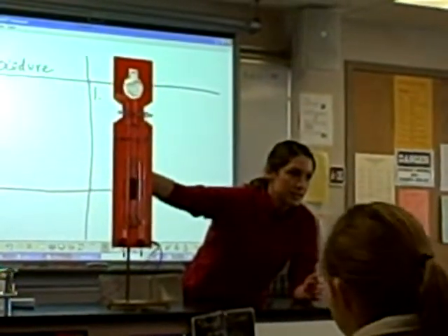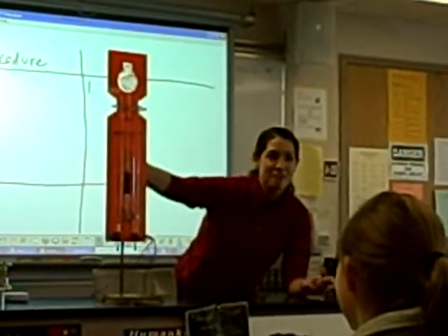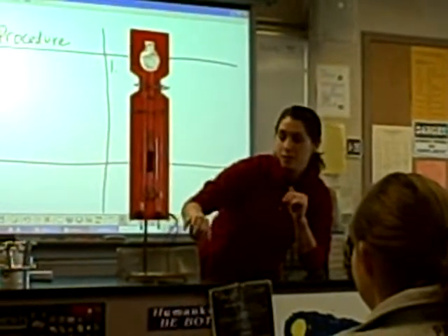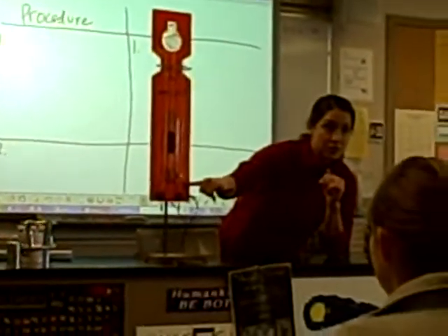Hoffman apparatus. Not a Kaufman apparatus. It'd be much cooler. A Hoffman, okay? The name of it doesn't matter. What it does matters. What are these things? Electrodes, wires. They are connected through here. Wires go up into the solution.